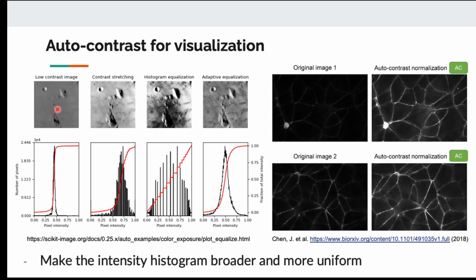But basically, you can think of a color image as multiple versions of the grayscale image, one describing each different color. When we look at a grayscale image, one thing that you can do is to plot the histogram of the intensity. In this image, most of the background has the same color, and you only have a small bright area and a small dark area.